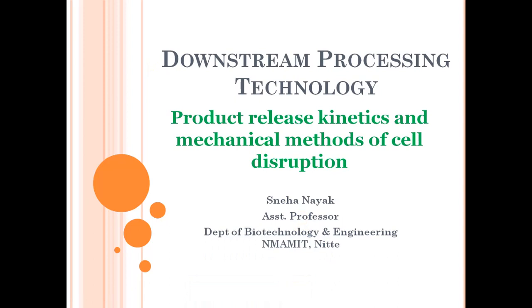Welcome to today's lecture on the topic product release kinetics and mechanical methods of cell disruption. So we'll study in a little bit of detail the importance of understanding product release kinetics, and also various mechanical methods used for cell disruption. In mechanical methods of cell disruption, we will see the homogenizer systems which are widely used for cell disruption.